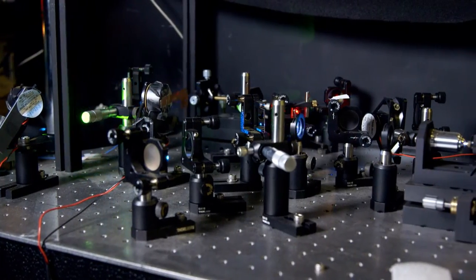We're in the Applied Optics Lab in the Baskin School of Engineering at UC Santa Cruz, and we're about to test some optofluidic devices for biomedical analysis.